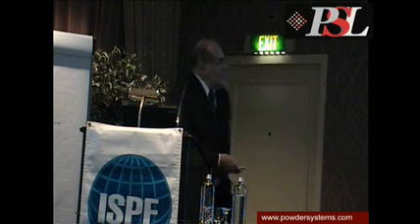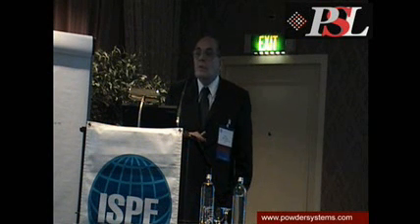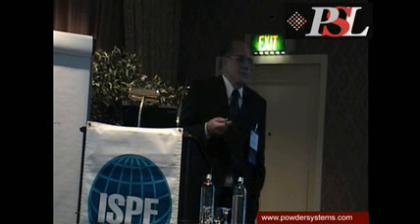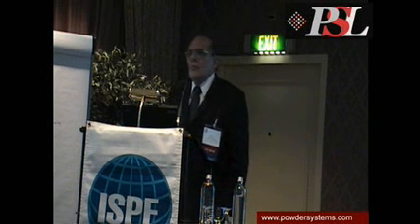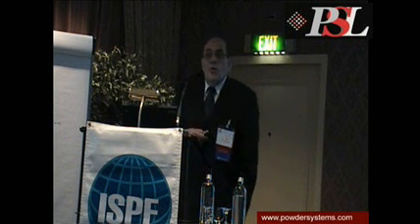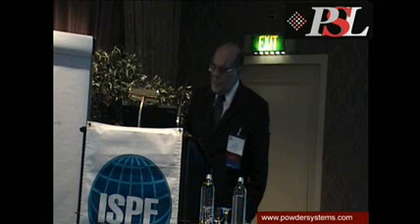And since these are all hooked up to one vacuum pump that's pulling, we traditionally use minus 19 inches of mercury, which I don't know what the conversion is, but that's pretty significant vacuum. You've got a substantial vacuum ballast around all of these, and even if you lose one of these samples because of a problem, everything will balance, because on the pump there is a vacuum release that maintains that negative pressure.